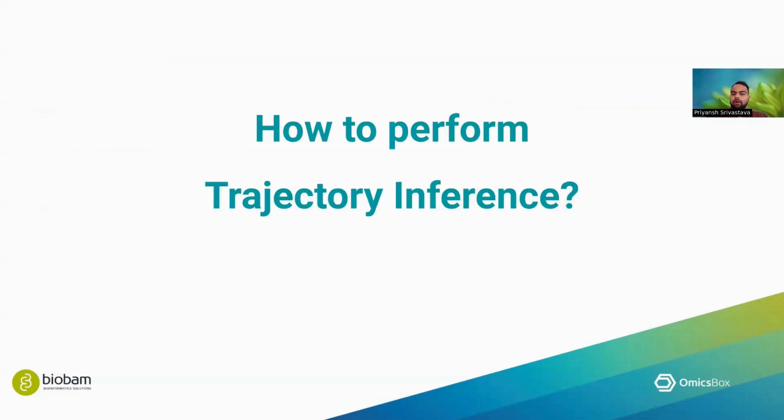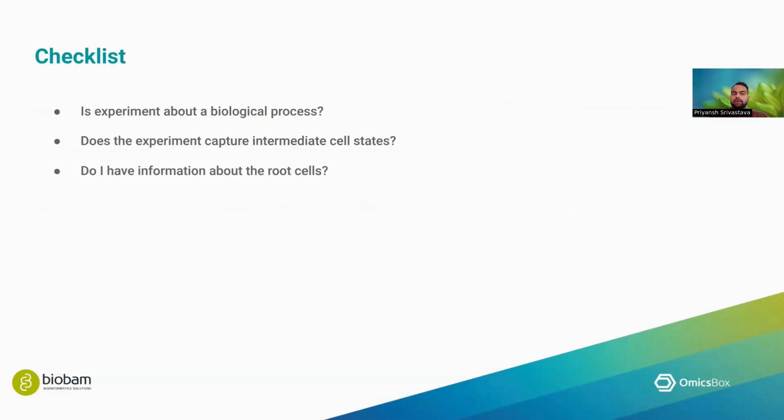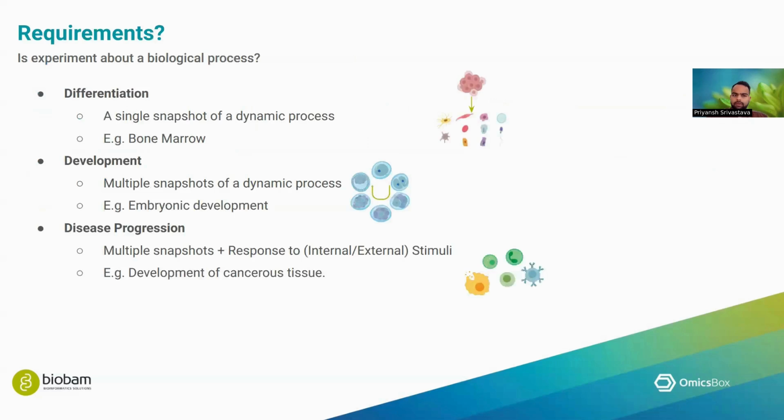Okay, so how do you perform trajectory inference? There is a checklist, or a bunch of questions, that you should ask before actually starting trajectory inference analysis, because any data set can be subjected to trajectory inference, but it might not yield any relevant results.